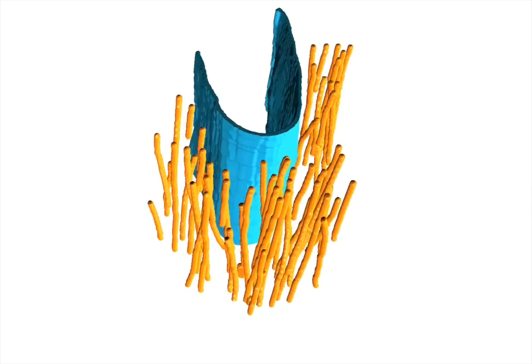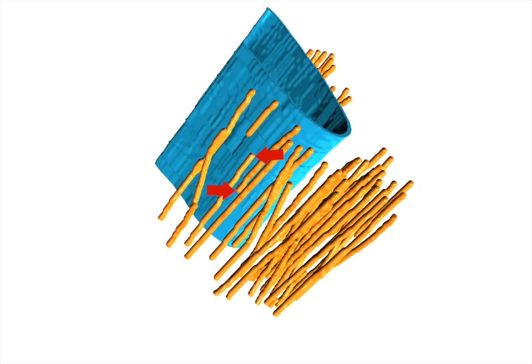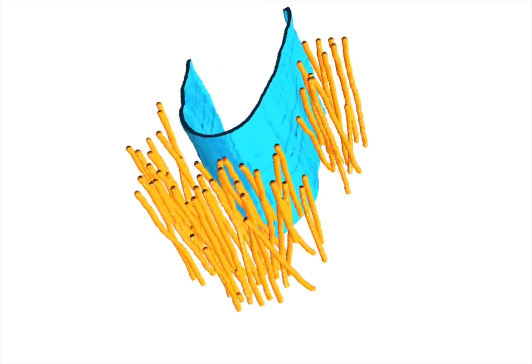The bundle is made of overlapping filaments, as filament ends could be seen in the middle of the tomograms.